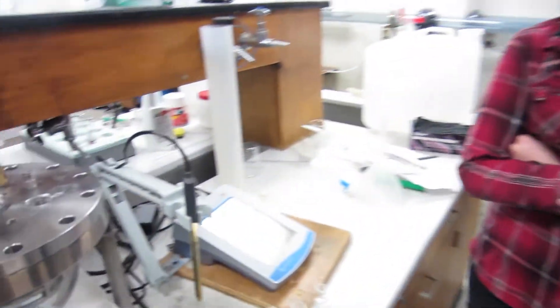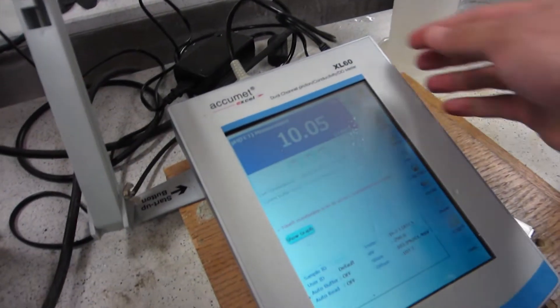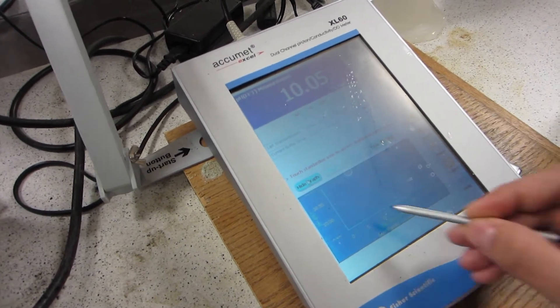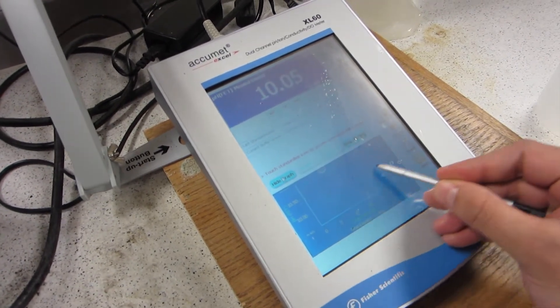As soon as you're on a particular screen, let's go look at it. It is recording. As soon as you're on this screen right here, you're recording. There's a little pen. You can show your graph, and you can see this will read and show you what your pH is at.